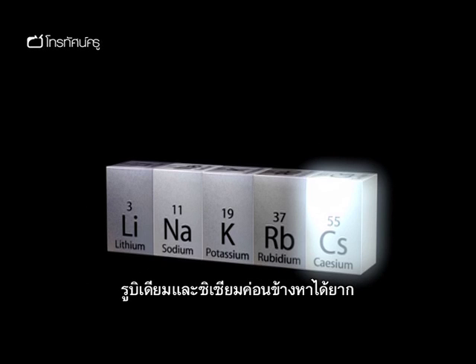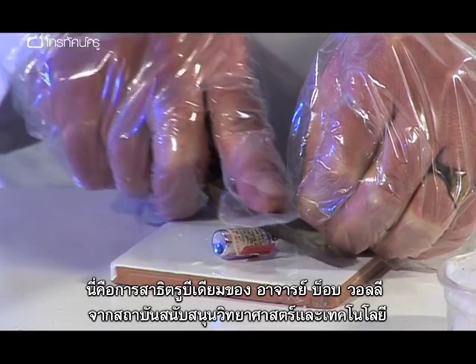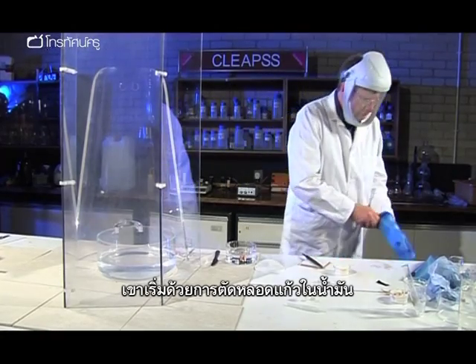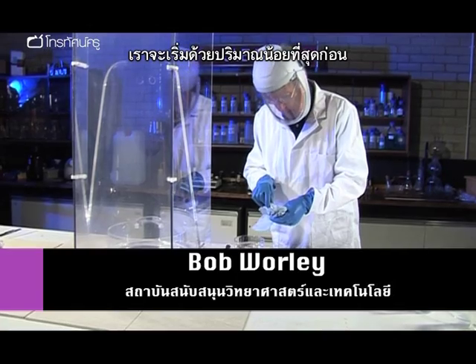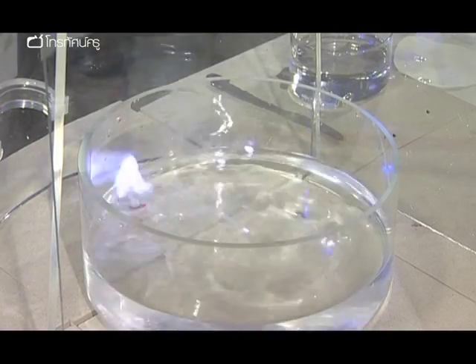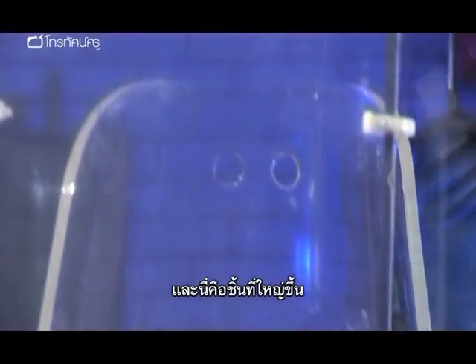Rubidium and cesium are quite difficult to get hold of. They're not banned, but you should consult an organisation like CLEAPSS before attempting them. Here's Bob Worley from CLEAPSS with rubidium. He started by breaking the glass vial under oil. This is the smallest amount going in first. And here's a bigger piece.